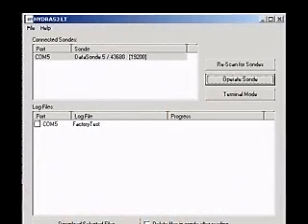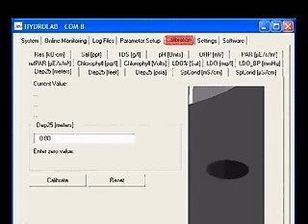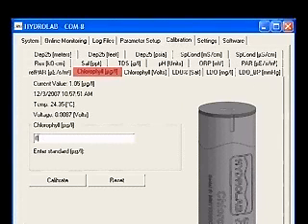Establish a connection to the Sonde with Hydrus 3LT. Click the button labeled Operate Sonde. When the Sonde finishes its initialization, click the Calibration tab, then click the Chlorophyll micrograms per liter tab. You'll see a picture of the fluorometer, as well as the current value, the date and time, the current temperature, and the voltage reading of the sensor.